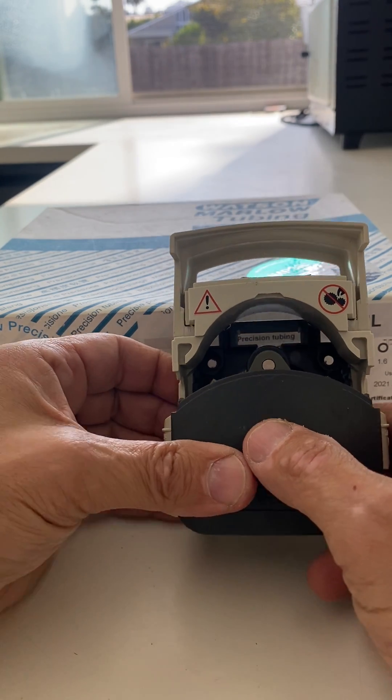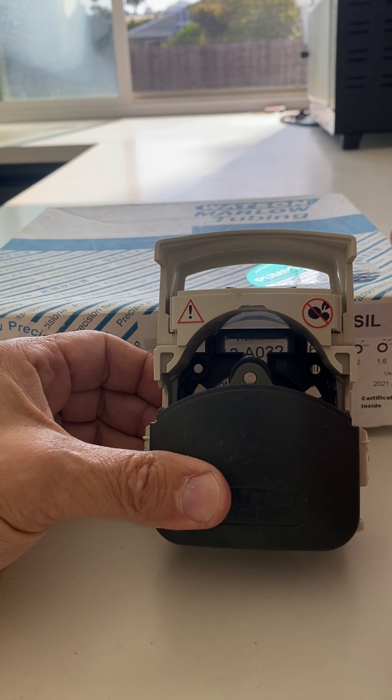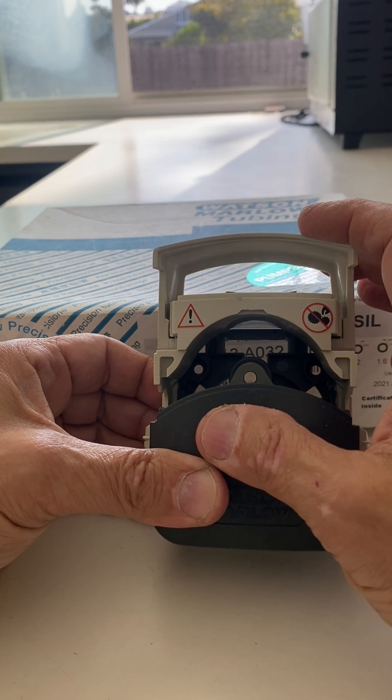This can be done while the head is mounted on the pump. I'm just doing it with the head off the pump to make it easier to see.